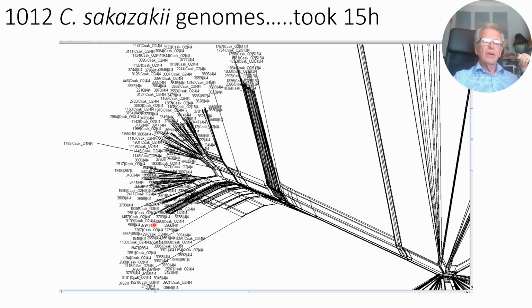You can find out which strains these are, which country they are that are bunching together. Are they from the same year? Are they from the same country, etc.? Are they the same serotype and stuff like that?